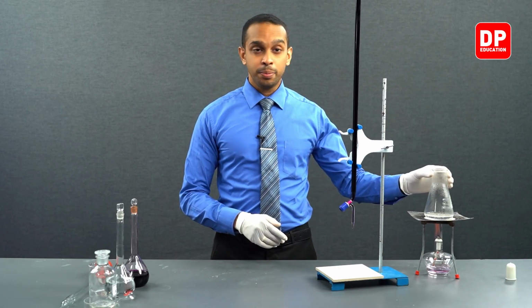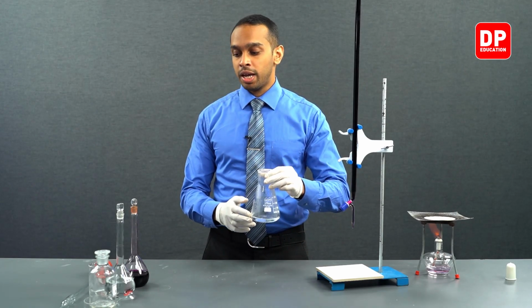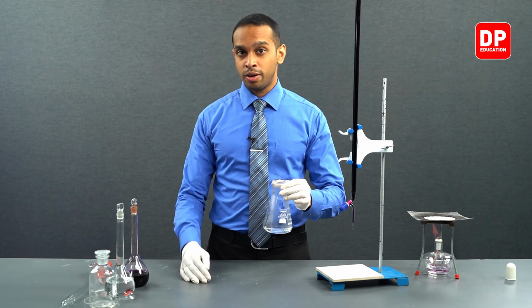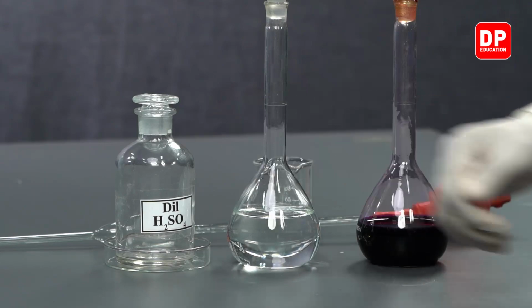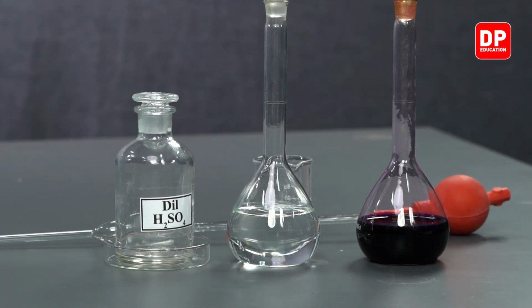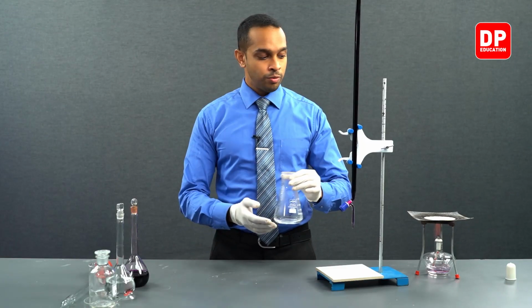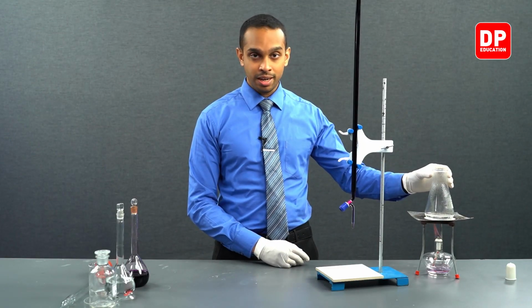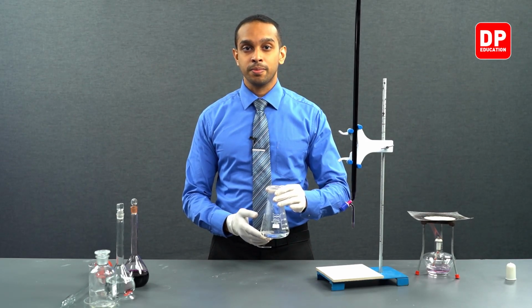So just like in the previous 2 titrations, to a titration flask, we have added 25.00 cubic centimeters of our potassium oxalate solution. We have added 15 cubic centimeters of dilute sulfuric acid, and then we have placed it on a spirit burner and we have heated it up to about 60 to 70 degrees Celsius.